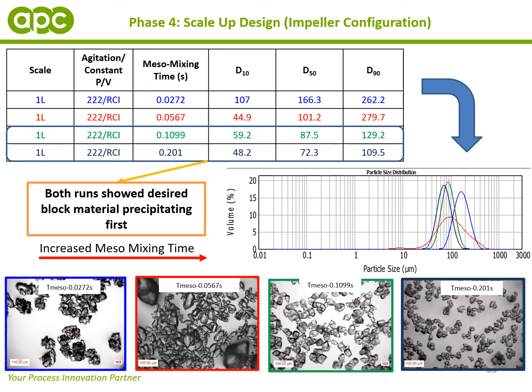But it was a good result to see that the needle morphology could be avoided while still maintaining this uniform population of particles. So we were happy that meso mixing times of around 0.1 seconds were what should be targeted.